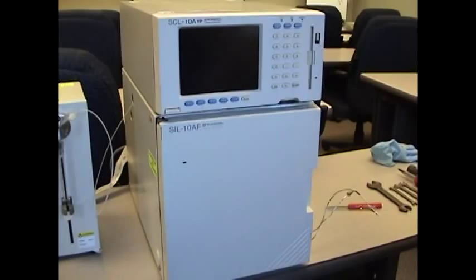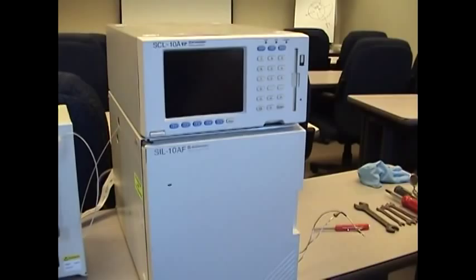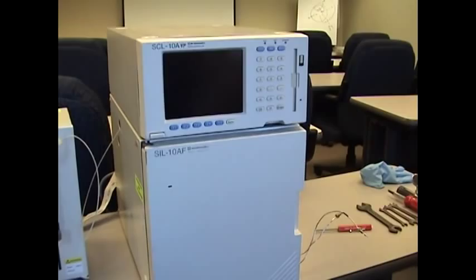This is a Shimadzu training video for an SCL-10A-VP controller with a SIL-10AF auto sampler. We're going to show you how to teach the needle to the injection port.